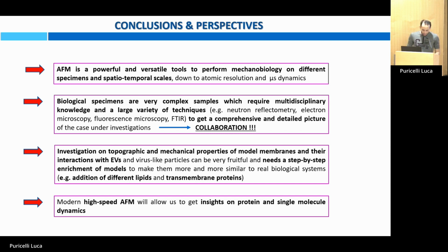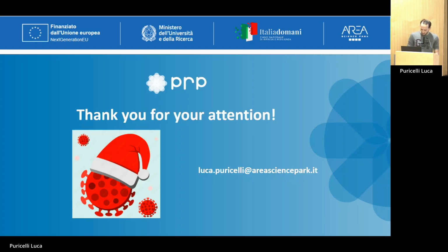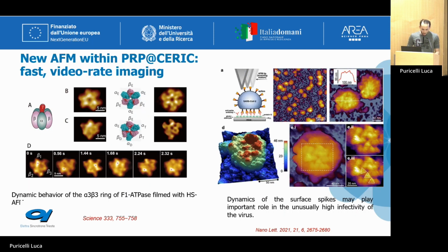And with this new instrument that we recently bought, we hope to be able to get insights on protein and single molecule dynamics, like you can see an example in this last slide. These are examples of what high speed AFM can do in biology.